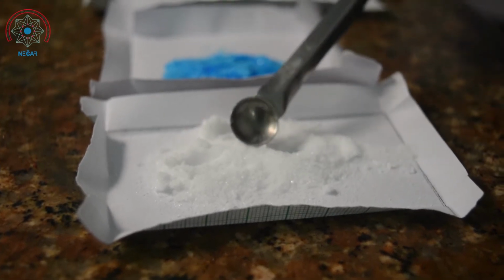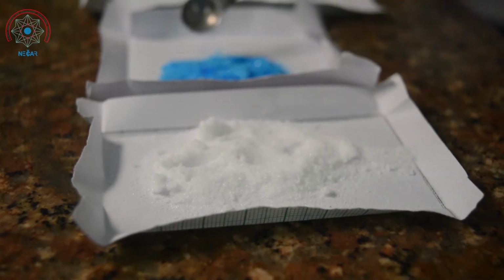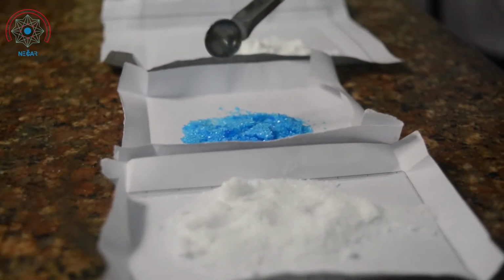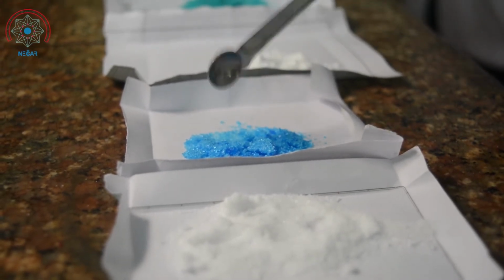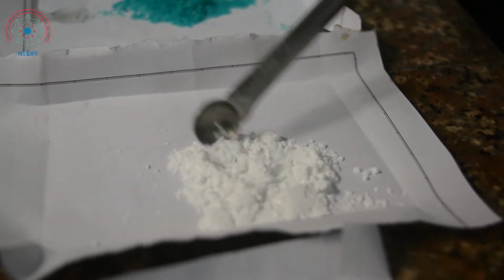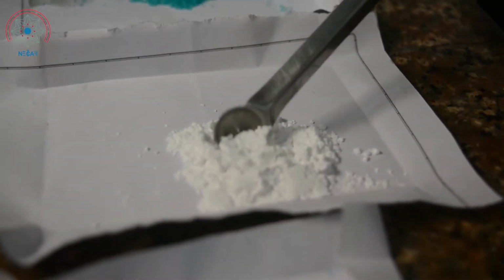See, this is crystalline, so there is a specific shape of these crystals. This is also crystalline, with a specific shape, and it has blue color. If you see this compound, you will see that it is powdery. In scientific terms, it is called amorphous.